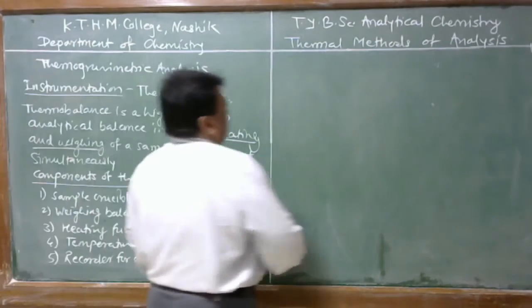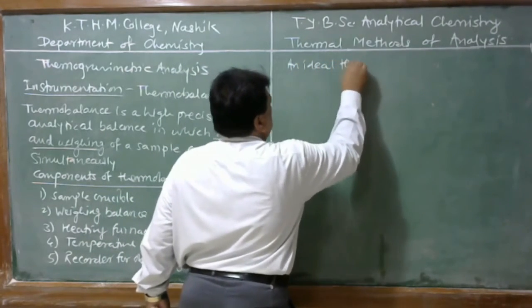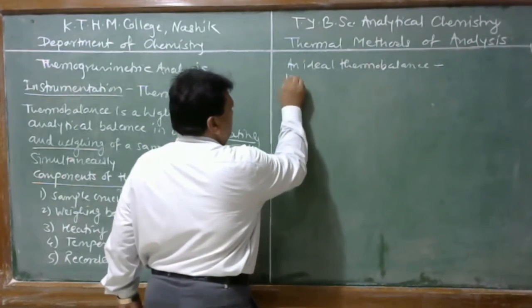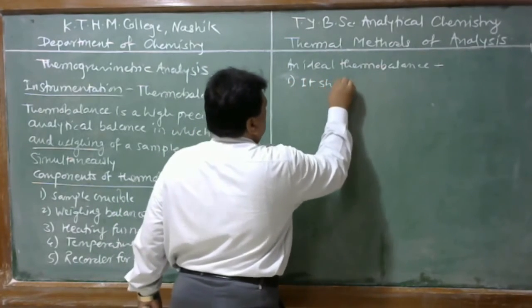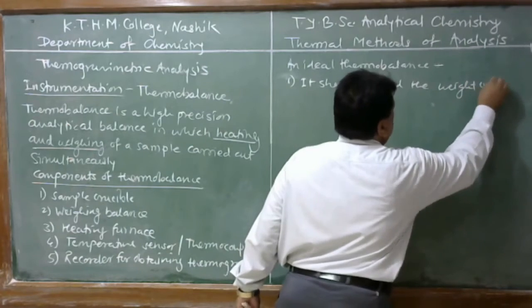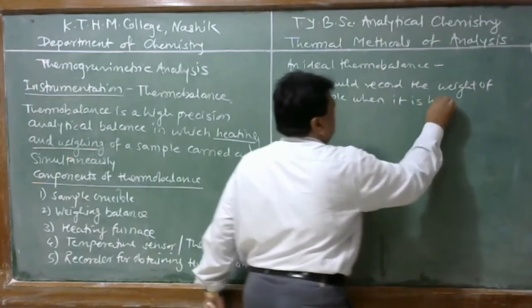An ideal thermobalance should satisfy the following requirements. Number one, it should record the weight of the sample when it is heated.